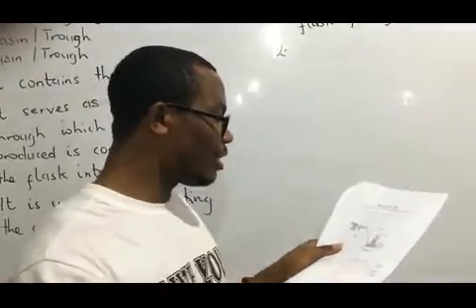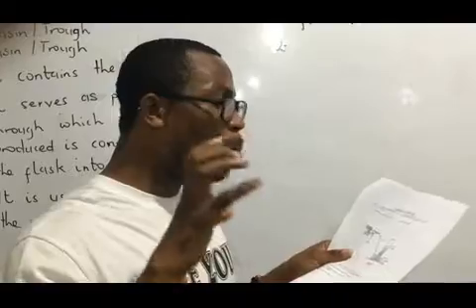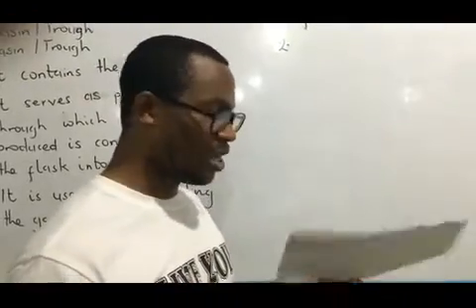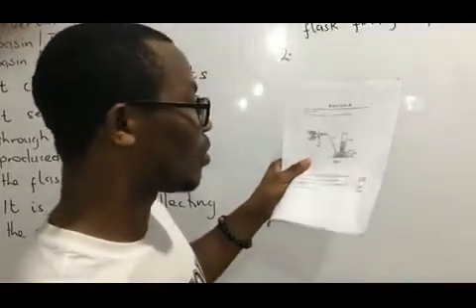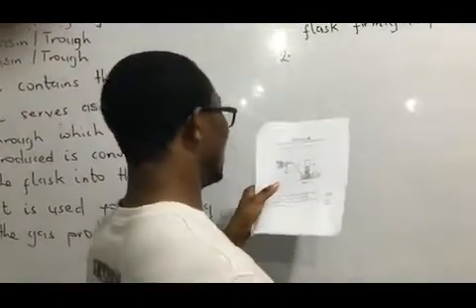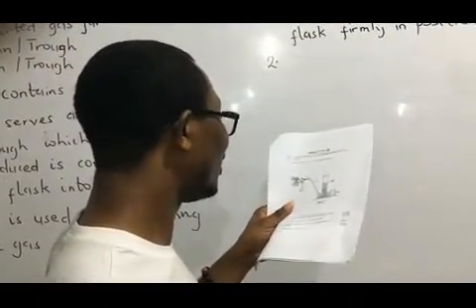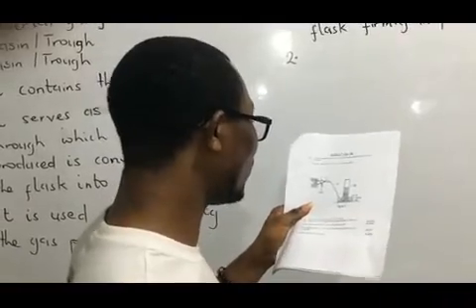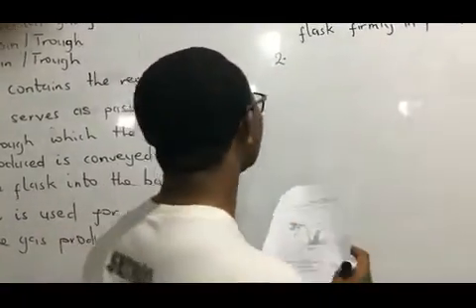So instead of ammonia chloride, it should have been ammonium chloride. So that is also an obvious source of error. Okay.